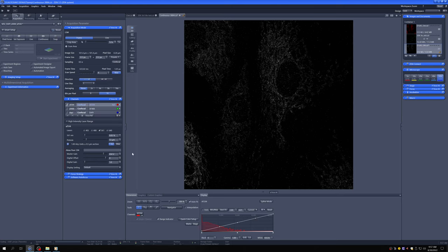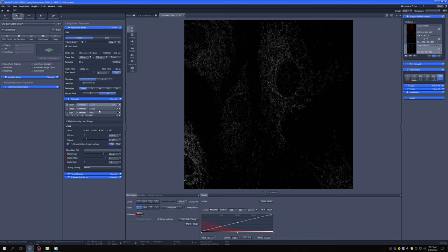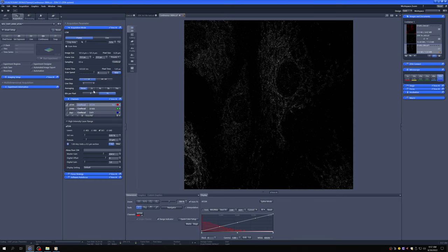What you can do if you're going to end up averaging let's say 4x in your noisiest channel, is at least not to overexpose the other channels to higher laser power. You go to those channels, you divide the amount of laser power you're using by whatever the averaging is in the channel that you need to do averaging, and then you just increase the master gain to compensate. That will make the initial images look worse, but when all the averaging is considered, they'll be just as good as where you started. That's a way to not overexpose things to laser if you don't have to, because when you do averaging, all of the conditions will be chained together and will have the same amount of averaging.